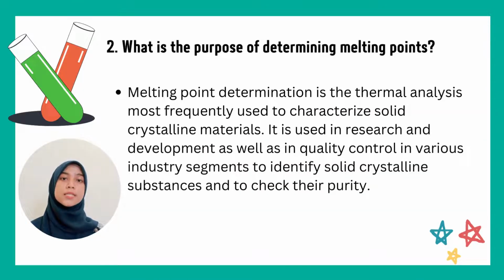Question 2. What is the purpose of determining melting point? The answer is, melting point determination is the thermal analysis most frequently used to characterize solid crystalline materials. It is used in research and development as well as in quality control in various industry segments to identify solid crystalline substances and to check their purity.